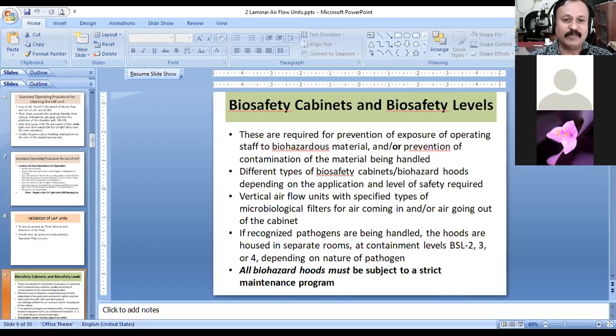that particular laboratory. Okay, then the bench surface, wherever you are working, the platform, should be impervious. That is to say, it should not allow any material to adhere to the surface, or to enter into the surface where it may stay for a long time, and then it may result in contamination of your material.